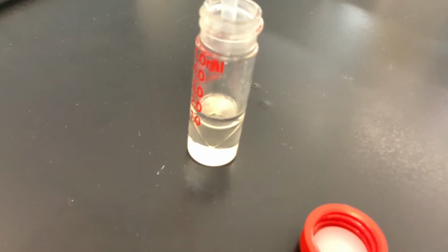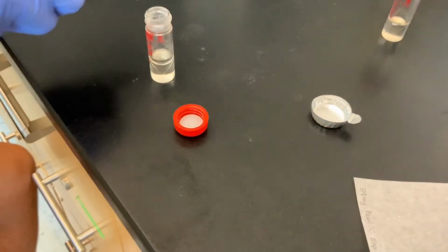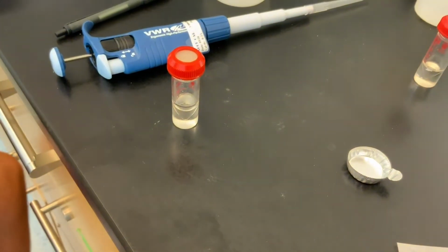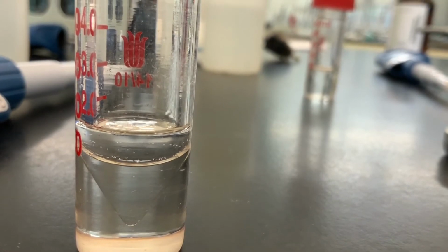So the water layer, say the aqueous layer, is sitting on top of the methylene chloride because it is less dense than methylene chloride. The density of methylene chloride is 1.33 grams per milliliter, and the density of water we say is 1.